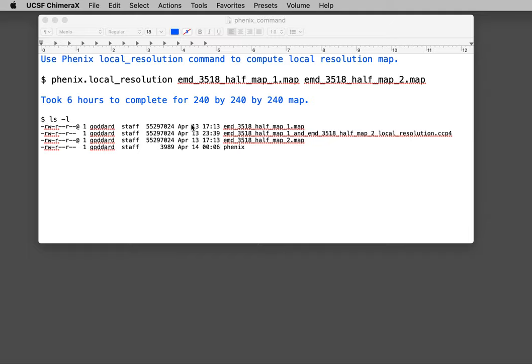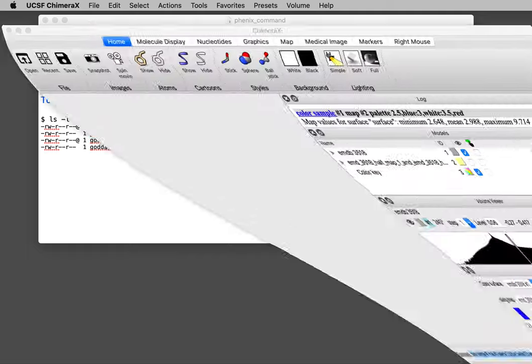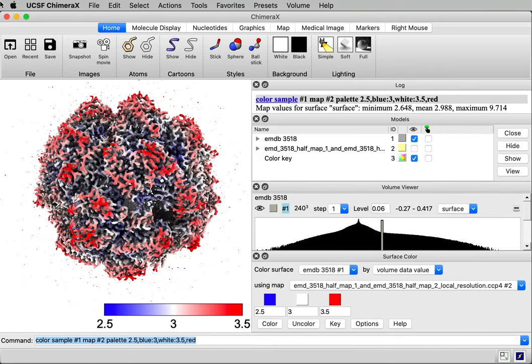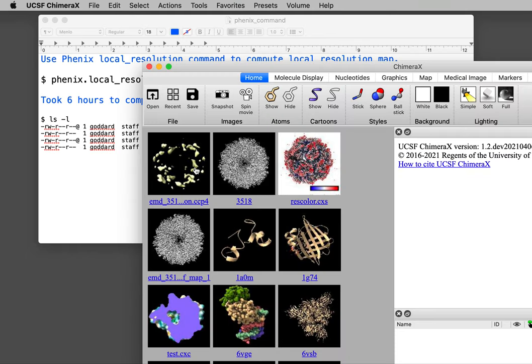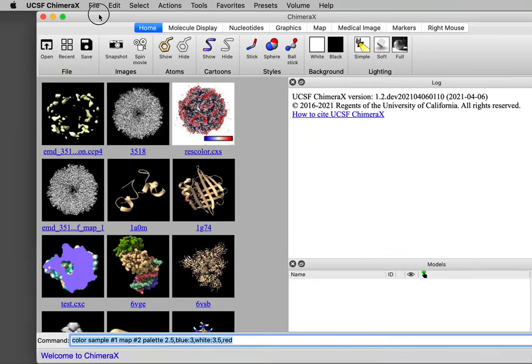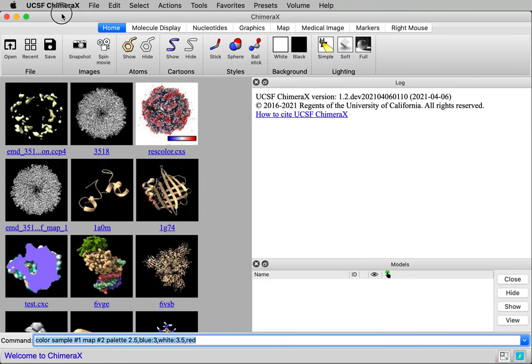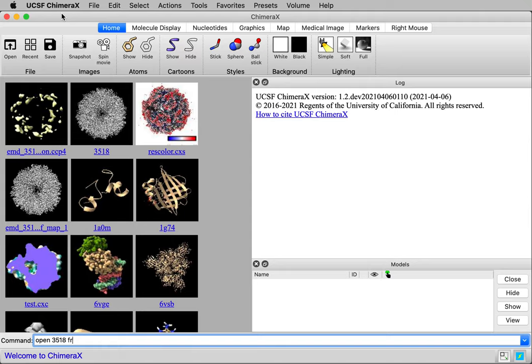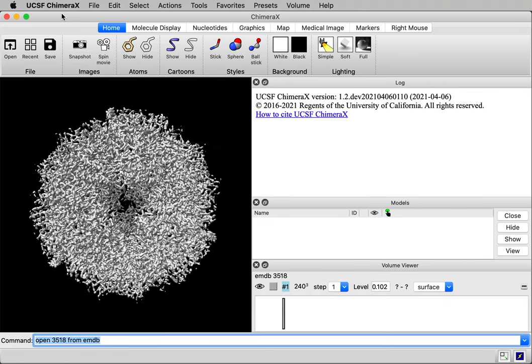So let's see how to do this coloring. I'm going to quit ChimeraX and we'll open the map. This is a map from the EM databank ID 3518. I'll type open 3518 from EMDB.